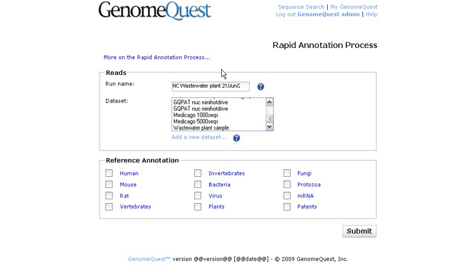The way it works is by comparing the sequences you upload to several reference data sets that you choose - genomes, genes, mRNA, etc.